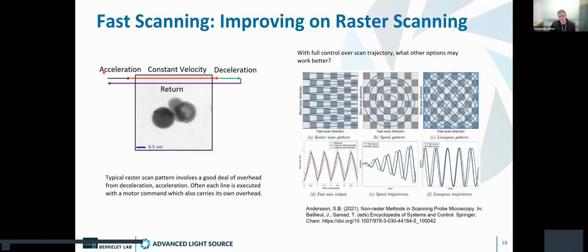And so the main speed up, well, there are several factors. The overhead removal of each line having to read out, and also the decoupling of the detector measurements from the motor trajectory positions really lets us go faster as well, because the motor controller won't let us go faster than like 0.3 milliseconds per position that you program into it. And so if we can sample faster than that, we can go much faster for that reason as well.